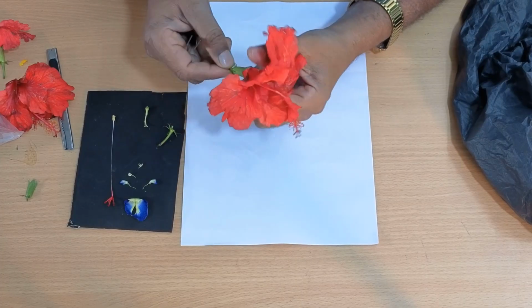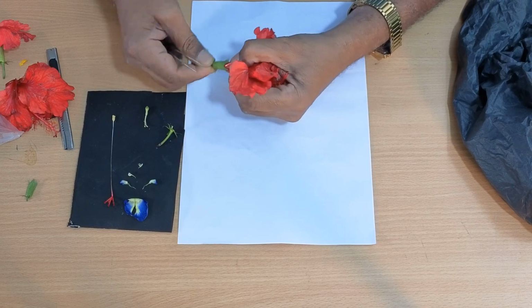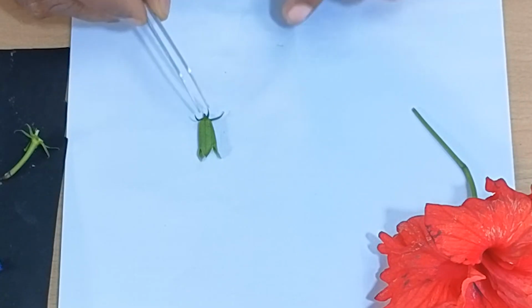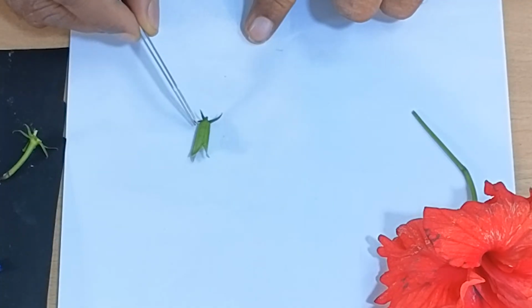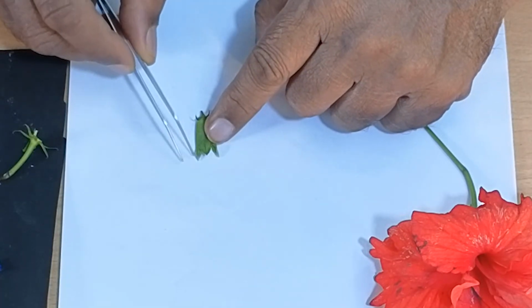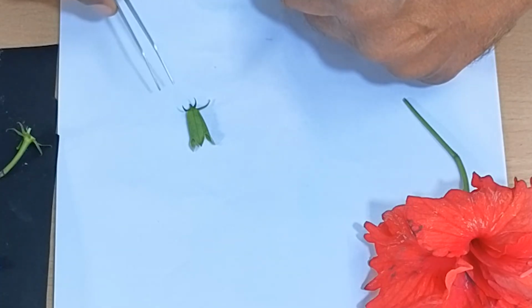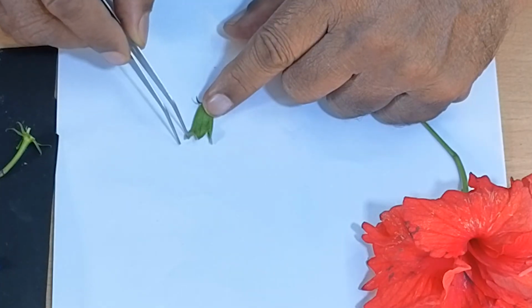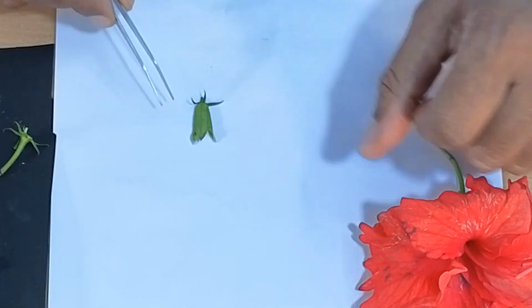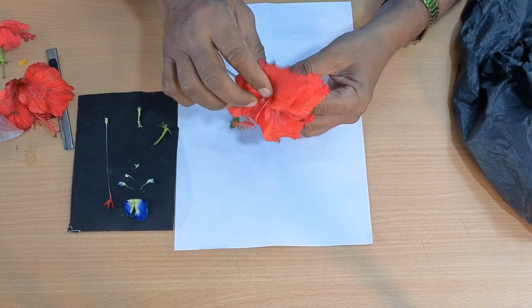And then of course you have the calyx, let me just dismantle this. Yes, here you have the epicalyx and then the calyx. This calyx has 5 sepals, and these sepals form a cup-like structure called gamosepalous, and this is a valvate aestivation. They touch each other, so it is called valvate aestivation. Then you find the corolla.